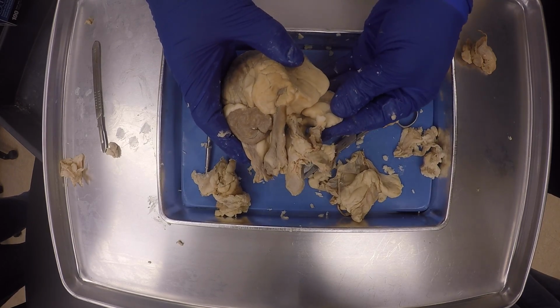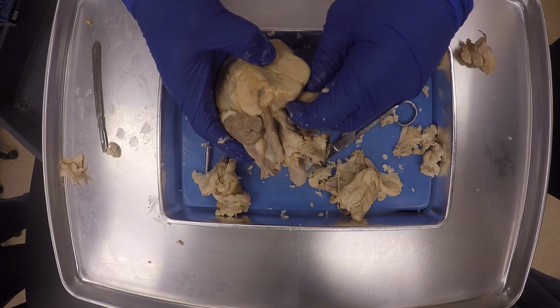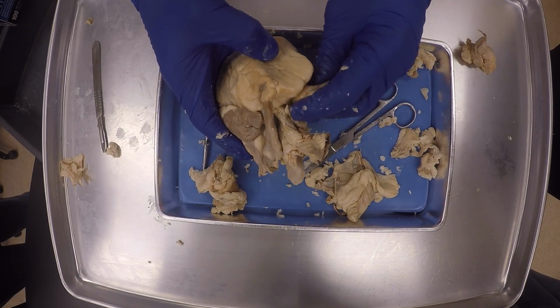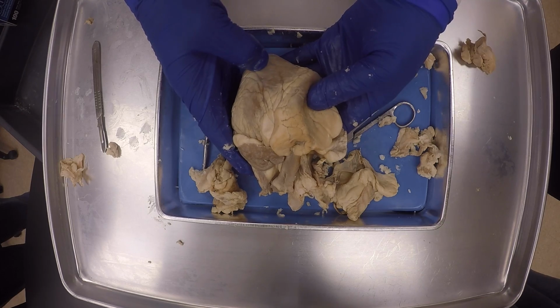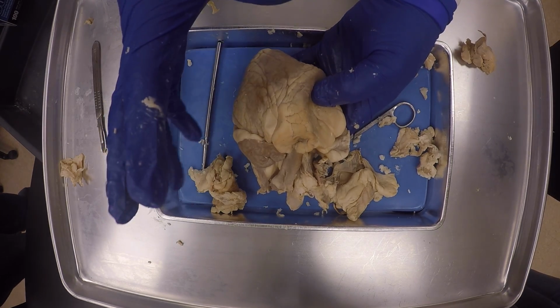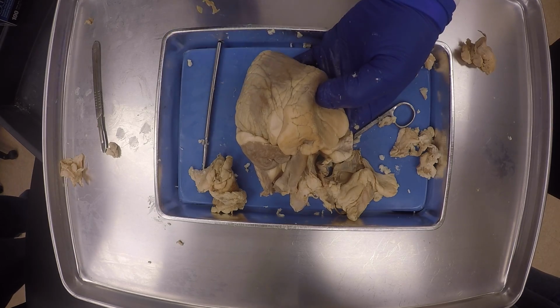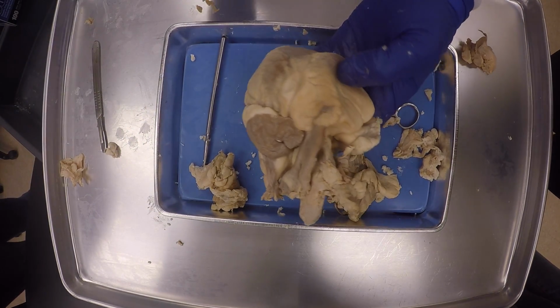That's why there's a right auricle, and that's the one that also has those pectinate muscles. When I cut through, you see the pectinate muscles. And when I cut through the ventricular myocardium, you'll see the trabeculae carneae, which are the bigger ridges in the ventricles. Okay, so I'm going to cut. So you can close it now.